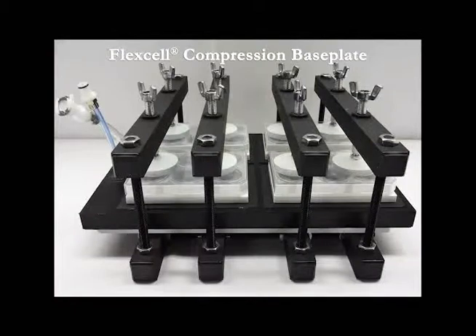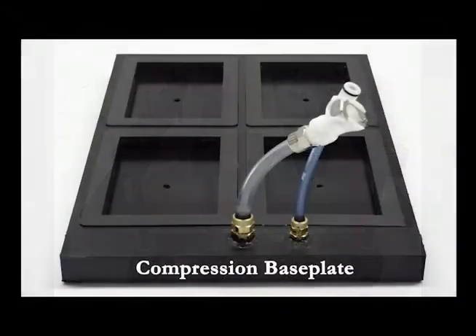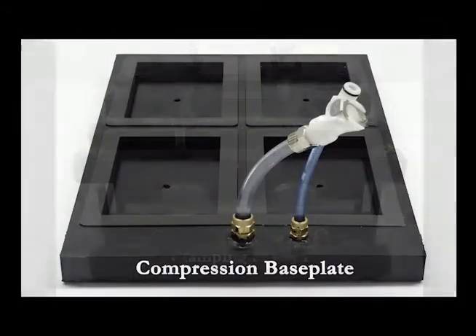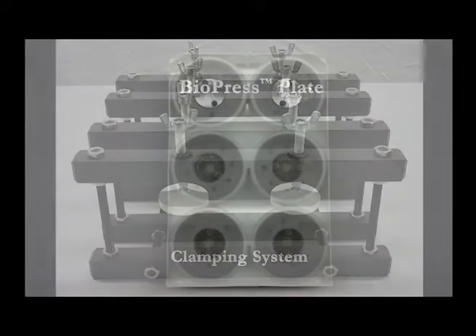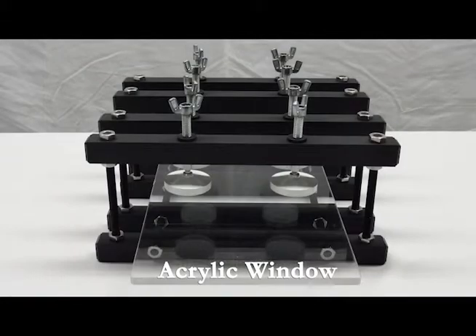To assemble your FlexCell compression base plate for use with six-well Biopress culture plates, you will need your black base plate and attached tubing, the clamping system, four Biopress culture plates, 24 stationary platens, and the supplied acrylic window.